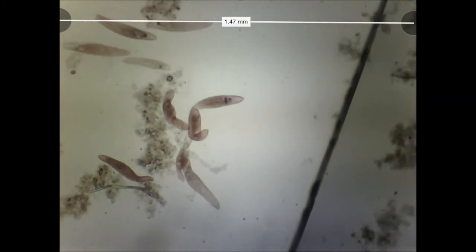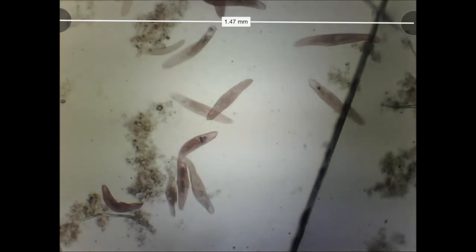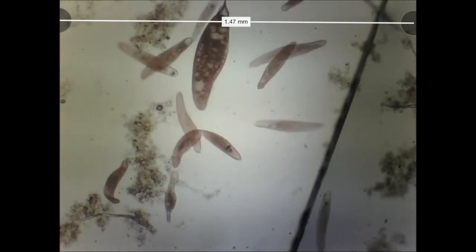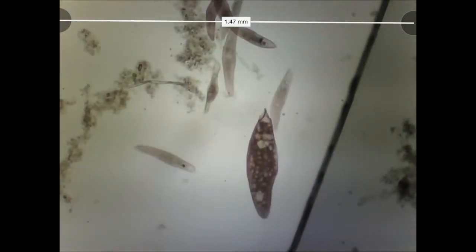Basically, all the cellular parts have split except for a little bit of cytoplasm between the two ends. And oh wow, look at that, there's one of the giant cannibalistic blepharisma.